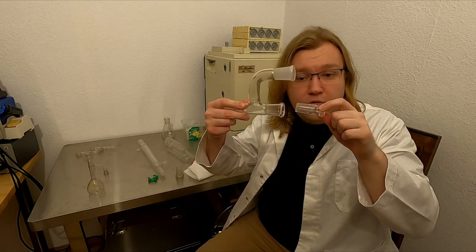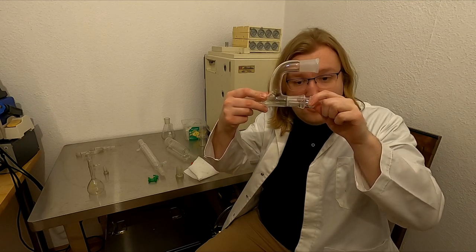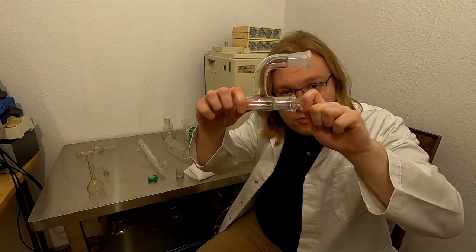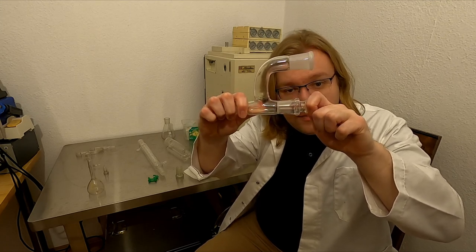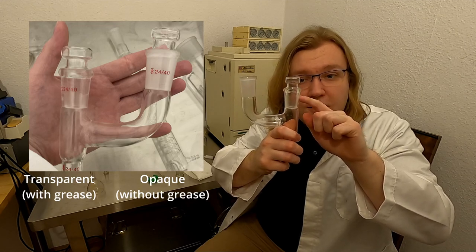Slide the male joint into the female joint, slowly twisting to distribute the grease. You can see the joint becoming more transparent, where grease makes a tight seal. This confirms that this joint is nicely sealed now.